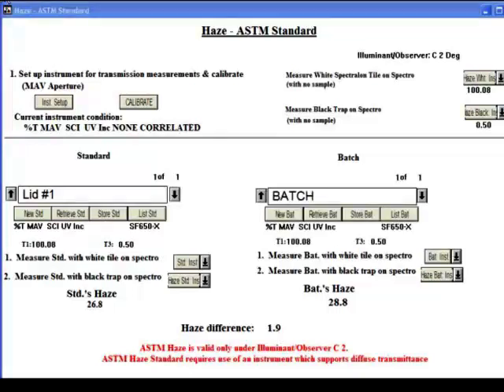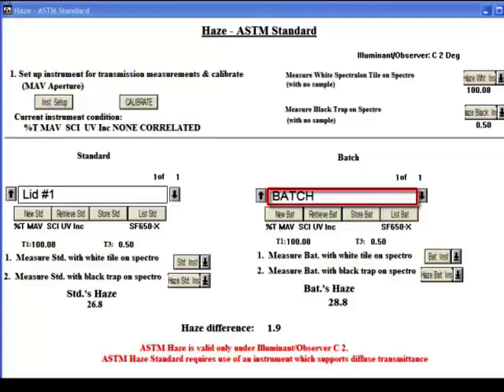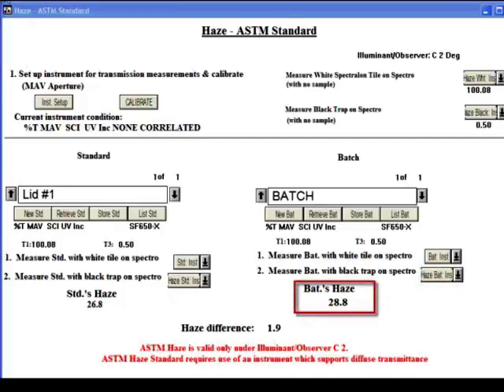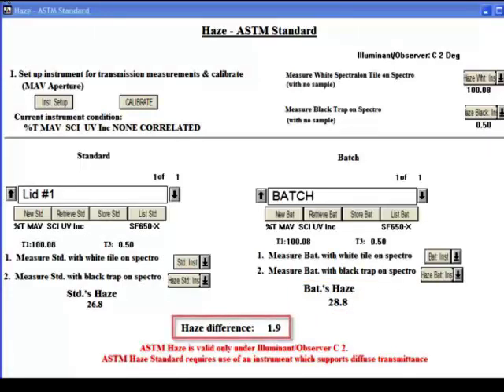To compare a second sample to the standard sample, replace the standard sample in the transmission sample holder with the new sample, positioning it in the same manner. Enter the name of the sample by clicking on the New BAT button below the dialog box labeled Batch on the right side of the screen form. Type the sample's name into the Batch Name dialog box. Measure the sample by placing the SpectralOn tile on the spectro and clicking on the BAT INST button in the lower right-hand side of the screen form. Place the black trap on the aperture plate of the spectro, and measure the sample by clicking on the Haze BAT button on the lower right-hand side of the screen form. The haze of the batch sample will be displayed in the lower right-hand side of the screen form.